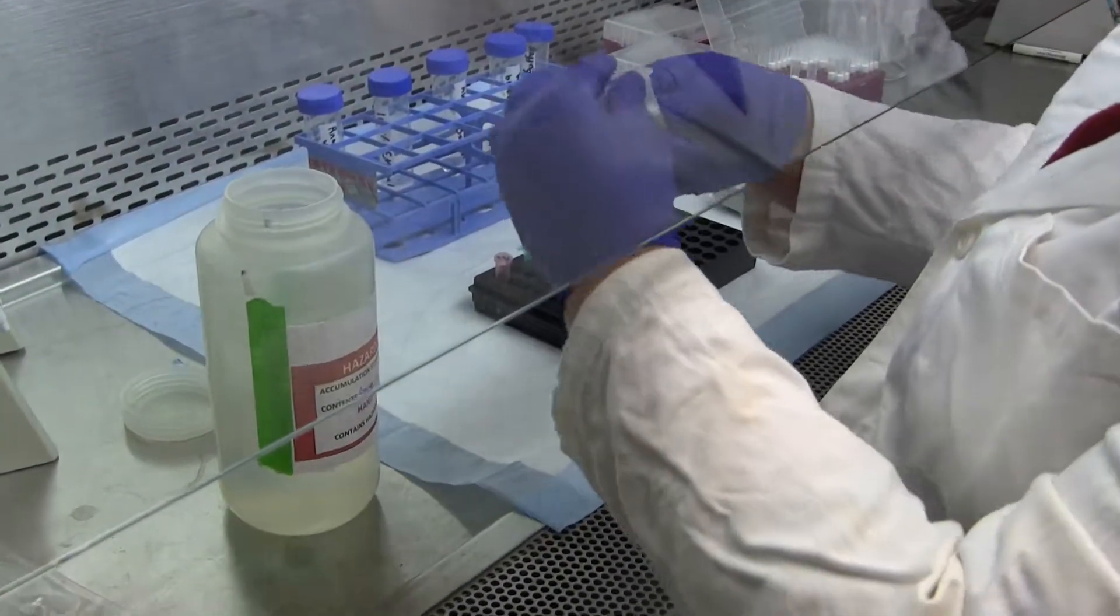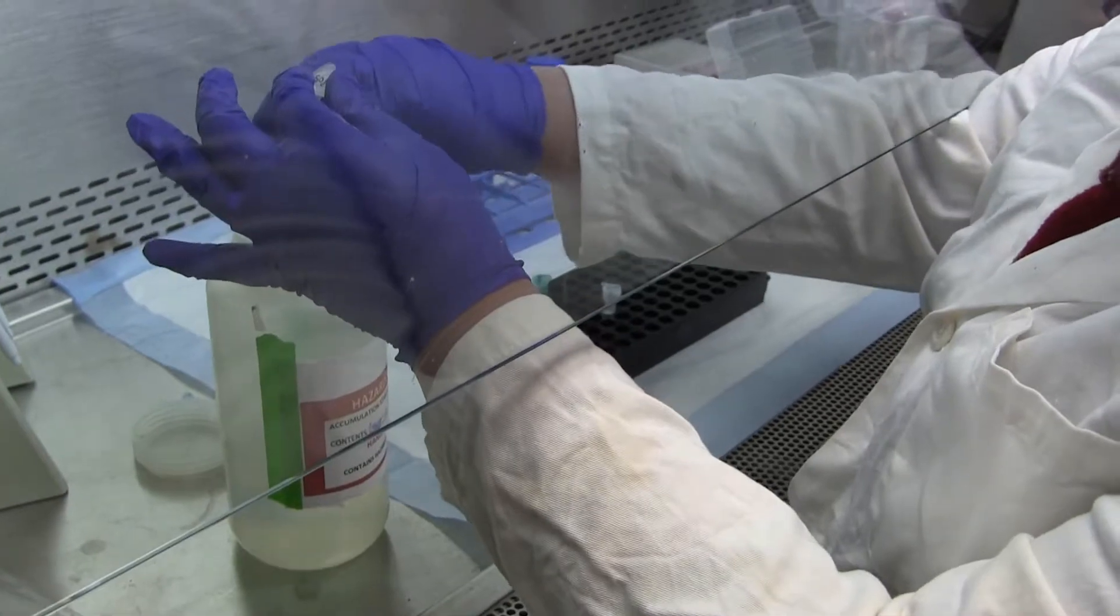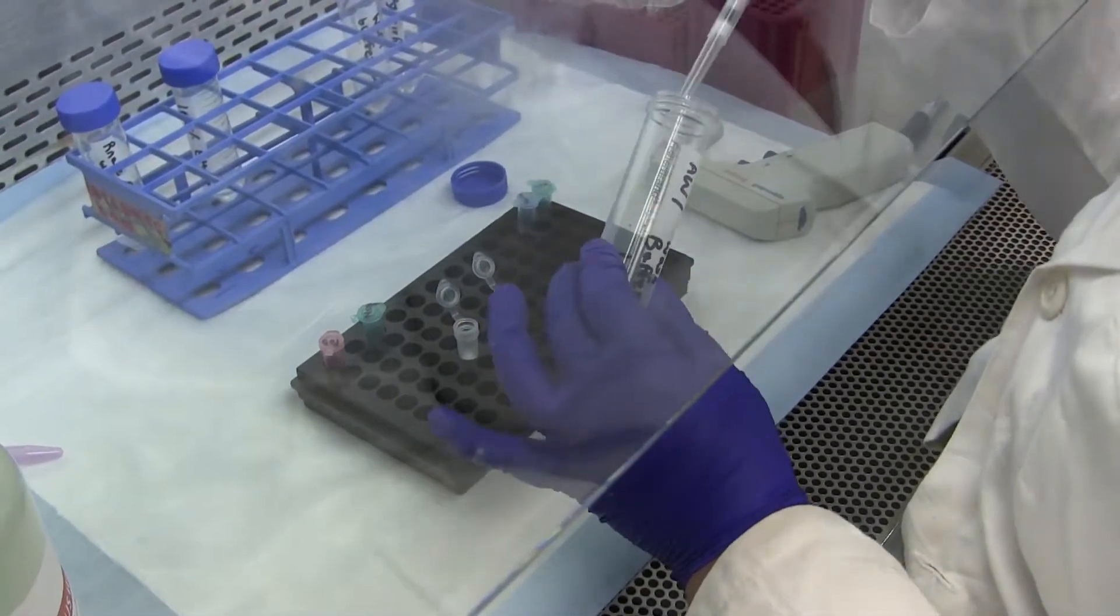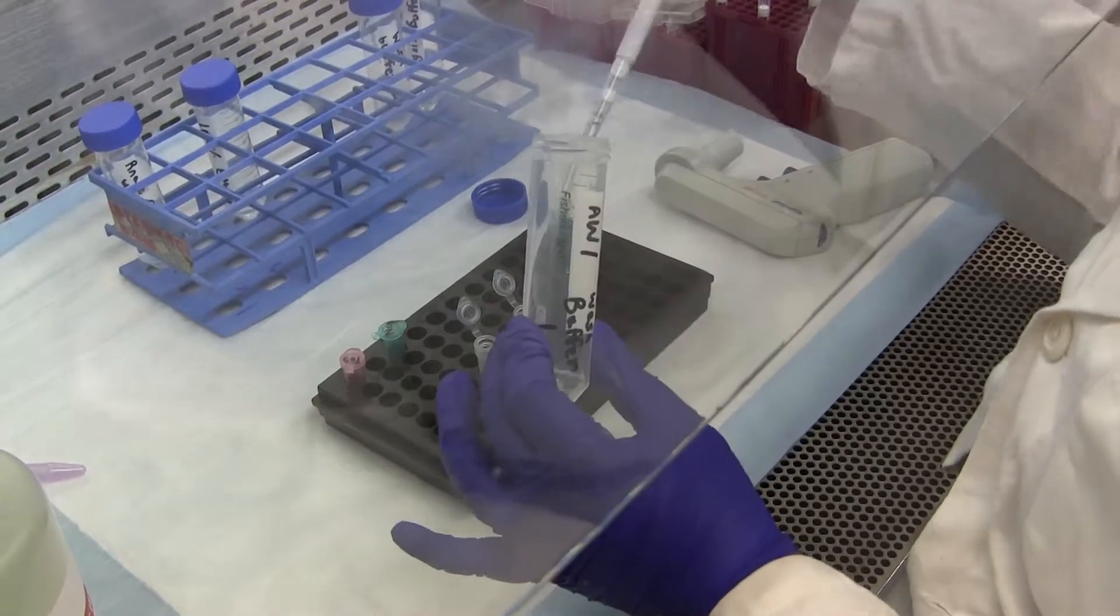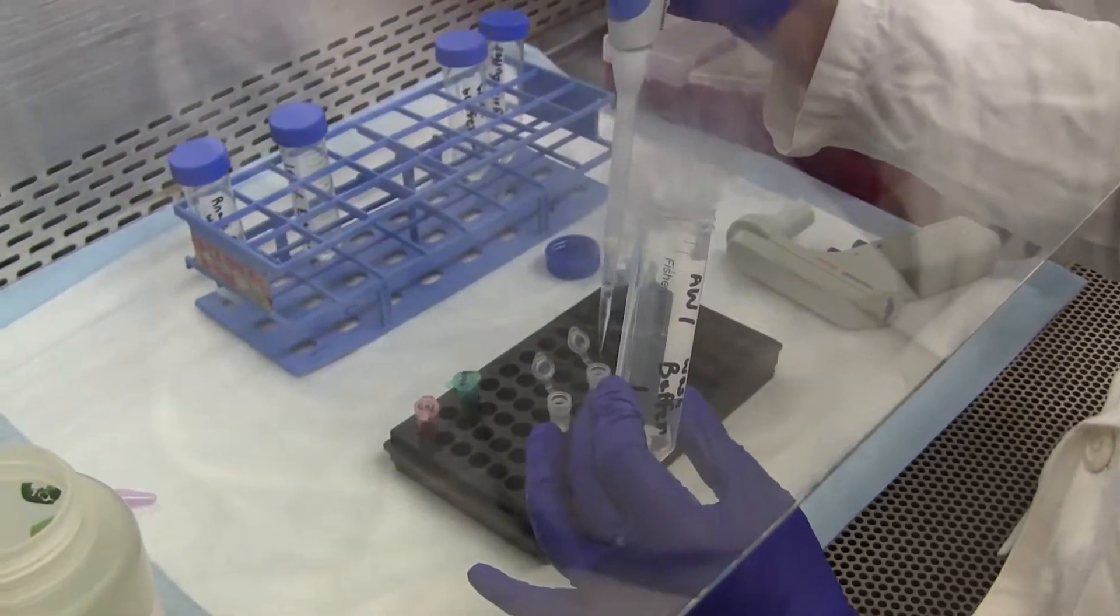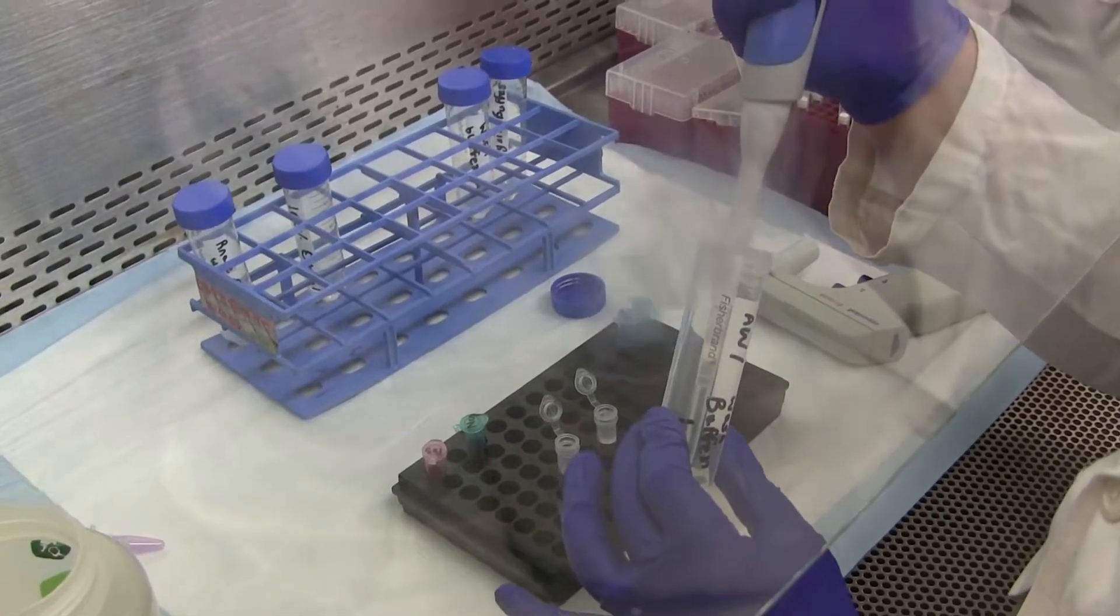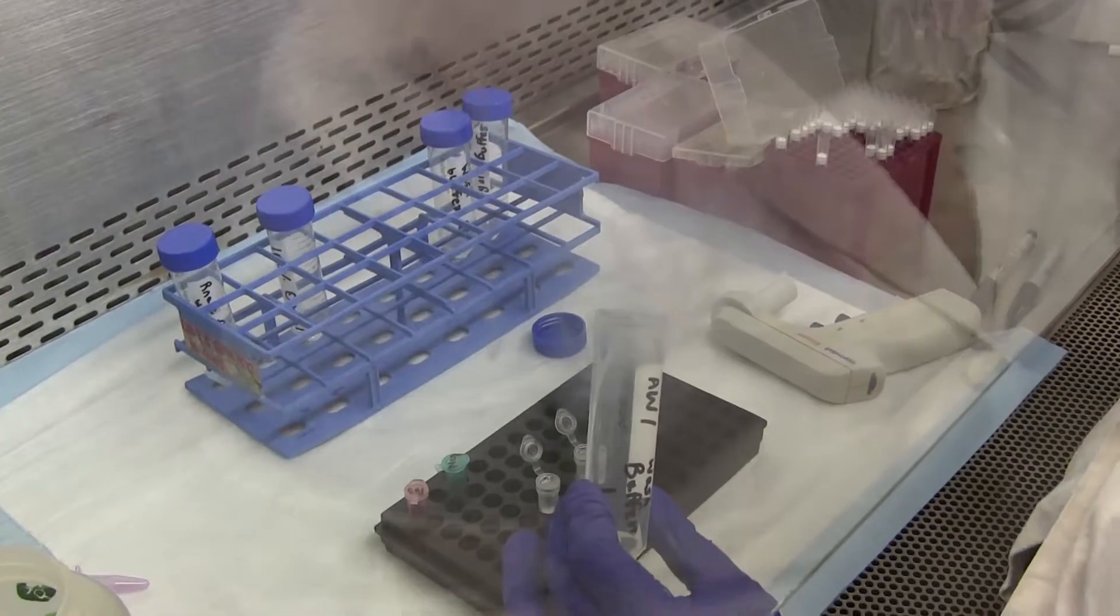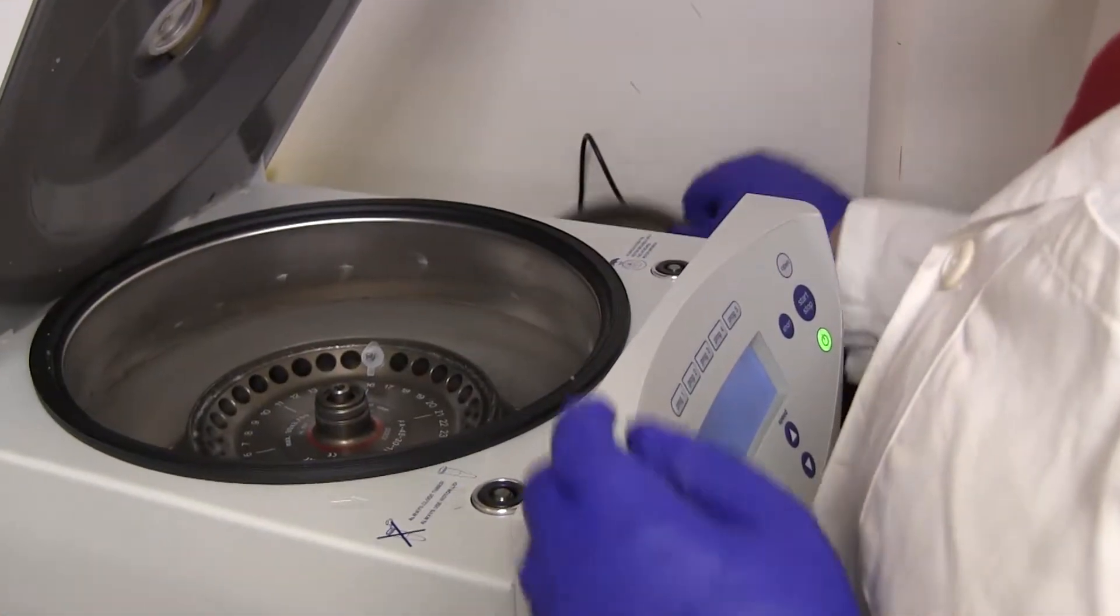So then after dumping the flow through, you're going to add 800 microliters of the wash buffer. And then if you hold it above the container, then you don't have to change pipette tips. But if it happens to touch that rim, then you have to change it. So next step is to centrifuge.